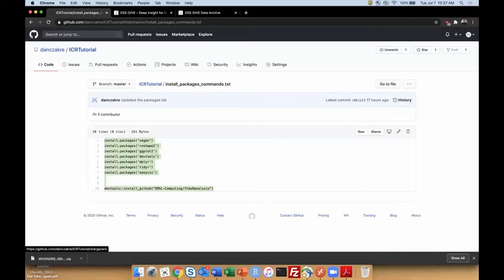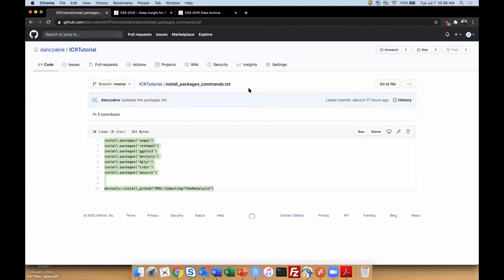Failed to install. Interesting. So again, there are problems. There might be variations in what versions of R folks are running in RStudio and things like that, which can also impact it. Cannot remove prior installation. One thing that might be causing that is that you don't have administrative privileges, though I don't know why that would be. You might have to close R to ensure that all your packages are unloaded and then restart R. Katie is mentioning that's my guess, that it's probably loaded and that might be causing errors.